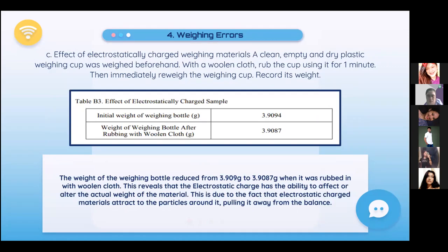Effect of Electrostatically Charged Weighing Materials: A clean, empty, dry plastic weighing cup was weighed, then rubbed with a woolen cloth for one minute and immediately reweighed. The initial weight was 3.9094 g; after rubbing, 3.9087 g. The weight was reduced, revealing that electrostatic charge has the ability to affect or alter the actual weight of a material. This is because electrostatically charged materials attract particles around them, pulling them away from the balance.